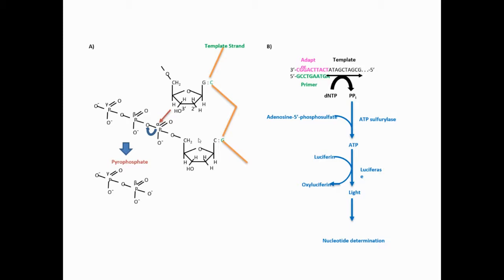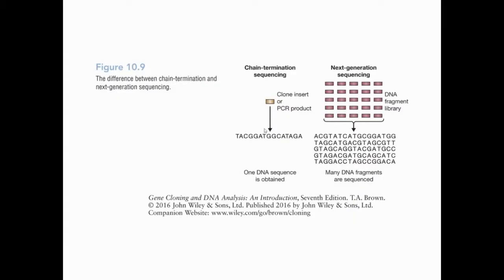genome. So people started thinking about in what way, instead of one at a time, we can do several at a time, right? Like 20, 100, 1,000 at the same time. And that's the beginning of the next generation sequencing, NGS.